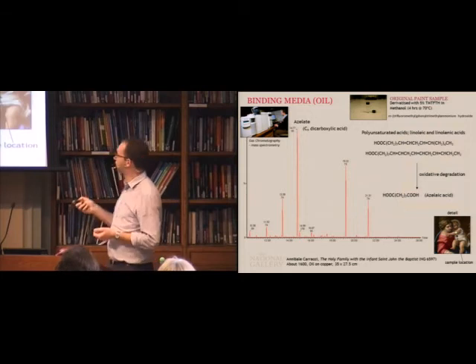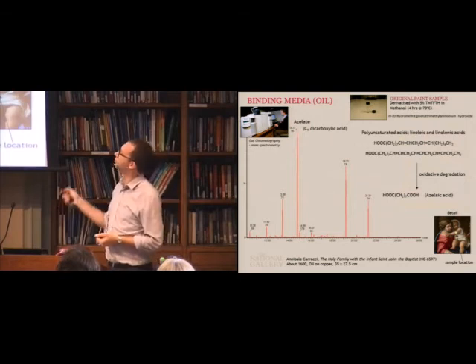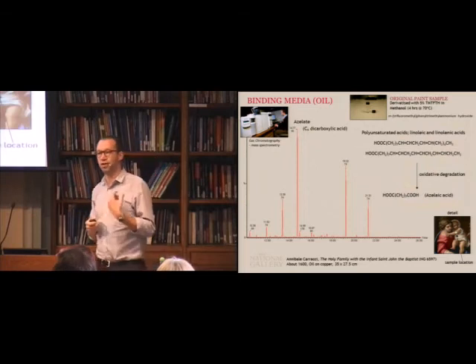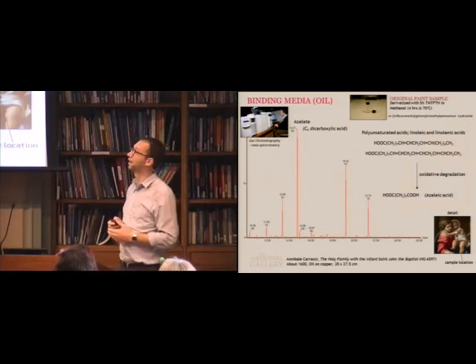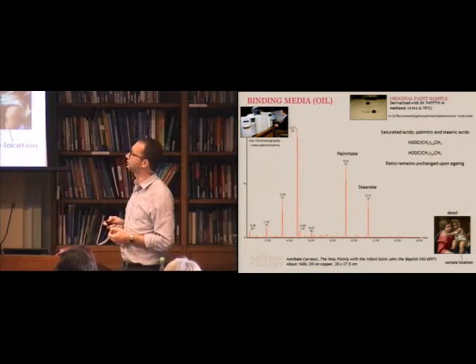This painting is not. So I've taken a sample from the elbow of the Christ child there. I've run it in my GCMS, I've derivatized it, I've run it in my GCMS, and this is what I get. So when I tell people I work at the National Gallery, they think I will look at paintings all day. I do look at paintings a lot, but I actually look mostly at things like this. And because that peak's there, I know I'm dealing with an oil paint.